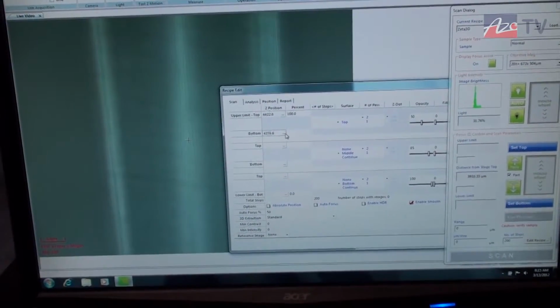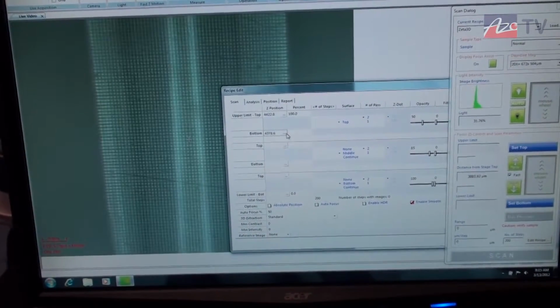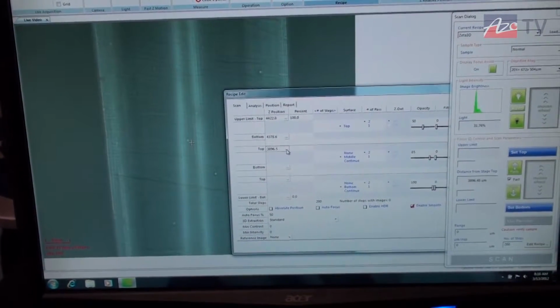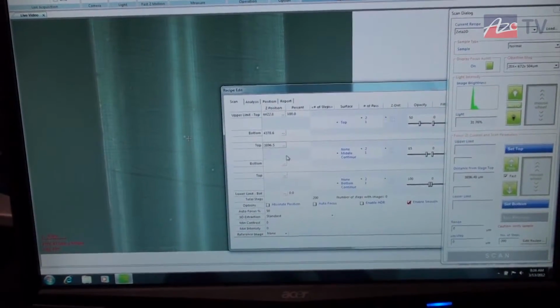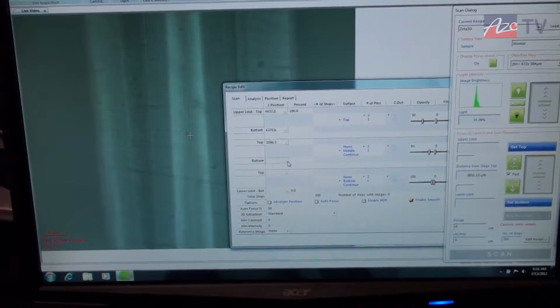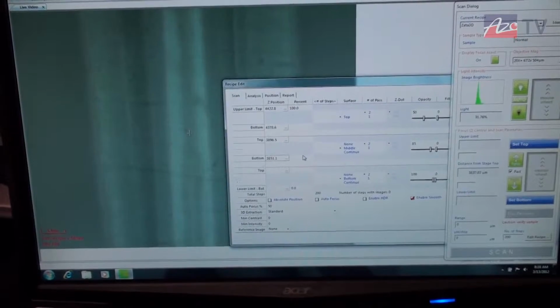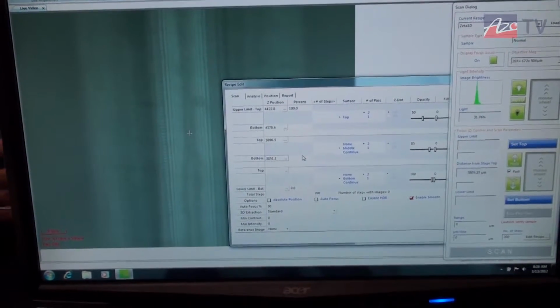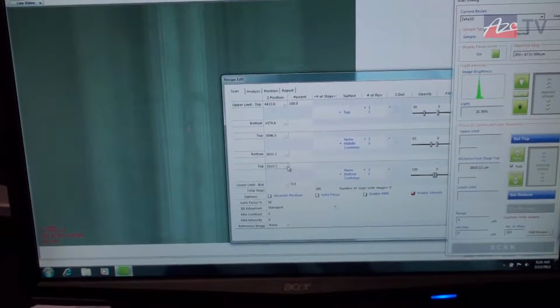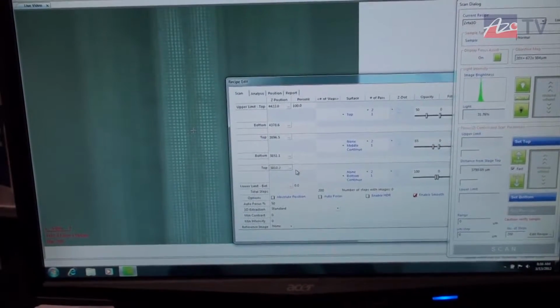So at this point, the next layer, which is the air gap or the top of the channel, is in focus. So I want to make sure I capture that. We'll do so by picking this as the top of the middle section. We'll make sure we capture the full top of the middle. So there's the bottom. And then we'll actually capture the bottom layer. So let's do that at this point. And then all the way through.